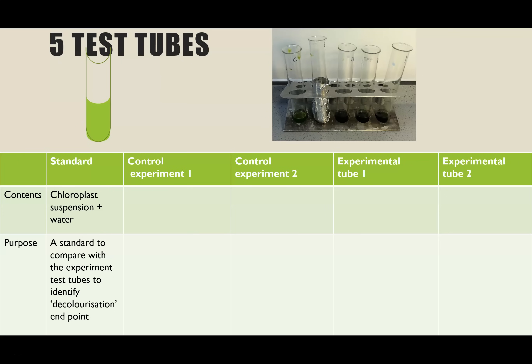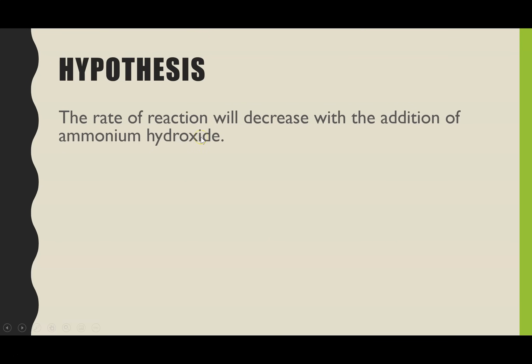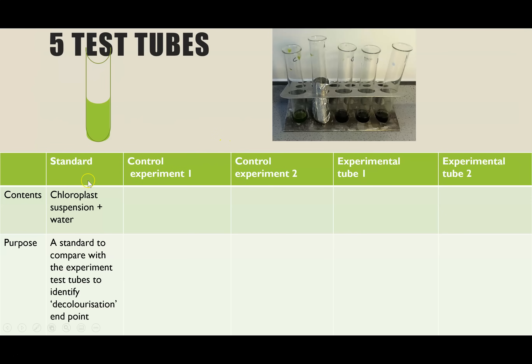For the method, I'm going to be setting up five test tubes. Only the last two are my experimental tubes where I'll be gaining the evidence or data to say whether the prediction is correct or not. The other three are to help with the validity of the experiment. I've got all five here already set up, and I'll show a diagram as well so you know what is in each tube.